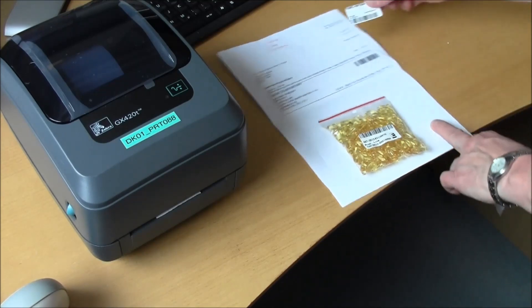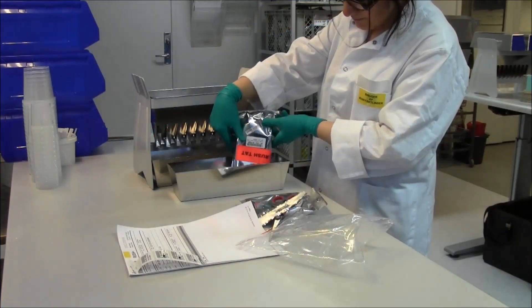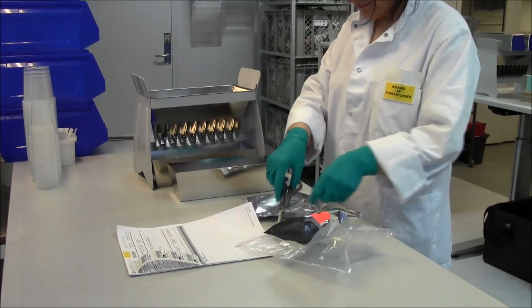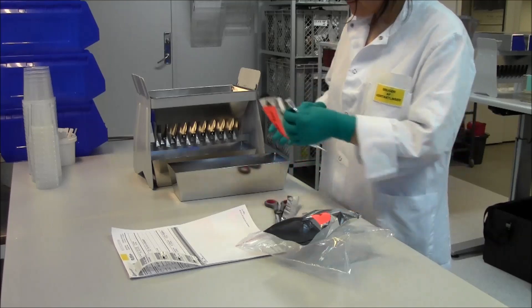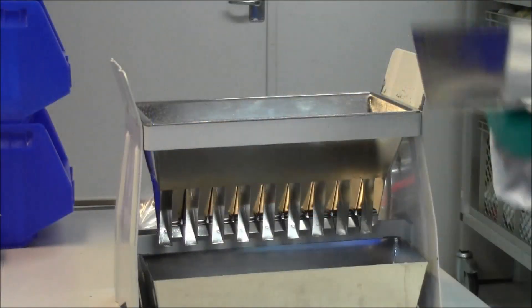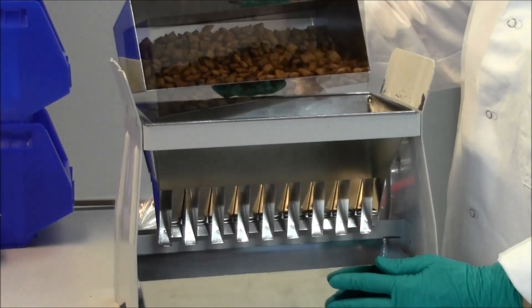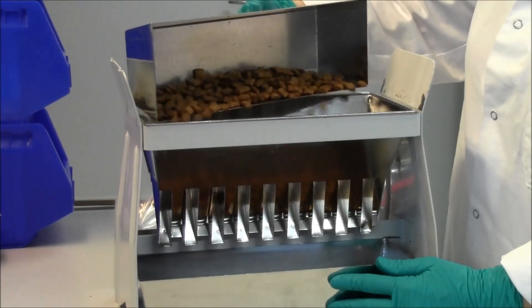Before any sample is analyzed, it will be prepared in our grinding and splitting department. Both matrix and parameter are taken into account before preparation. It is of high importance to get the samples homogenized to analyze on a representative sample.